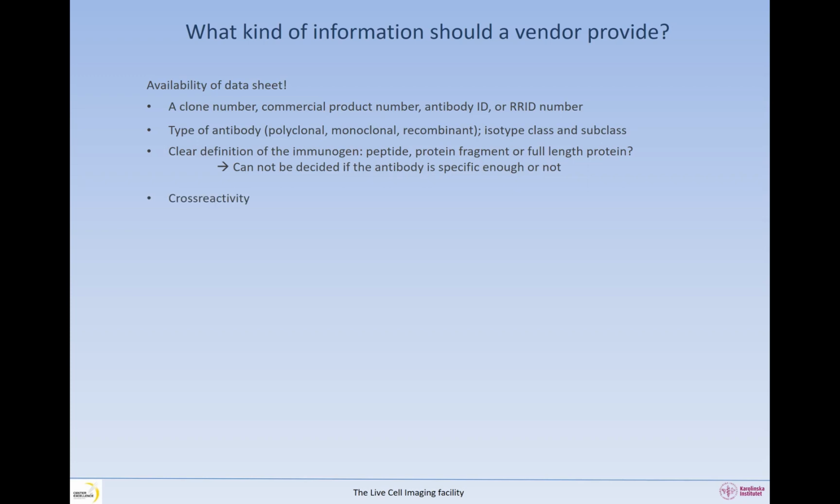Cross reactivity is also very important, and basically, by knowing cross reactivity, it will tell you, can I use this antibody for my application? And the more cross reactivity data they provide and they show, the better you can evaluate its usability in your application. And that also means, probably, I would say, that more company worked on validating this antibody.